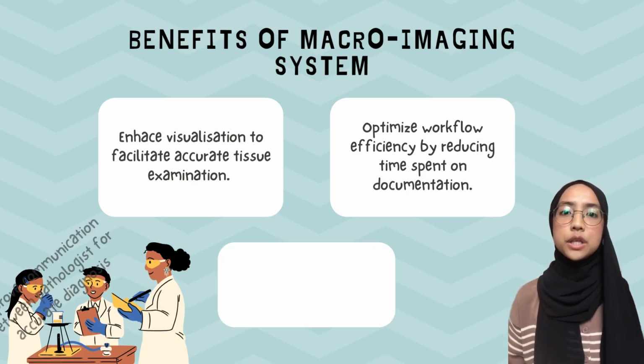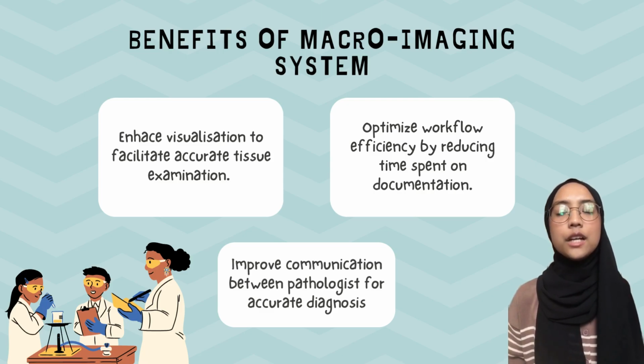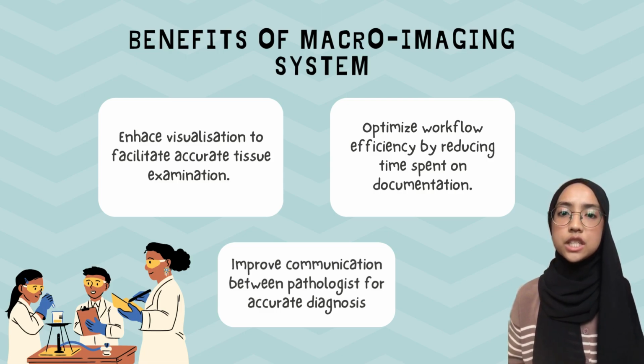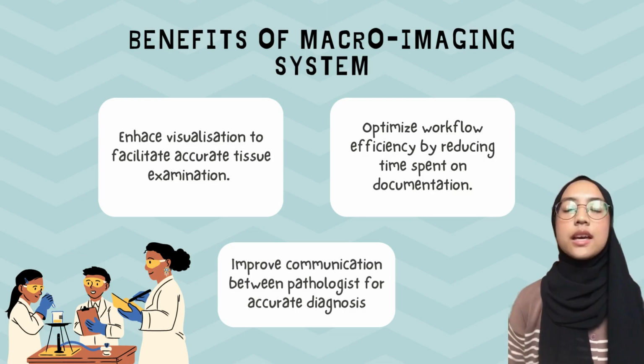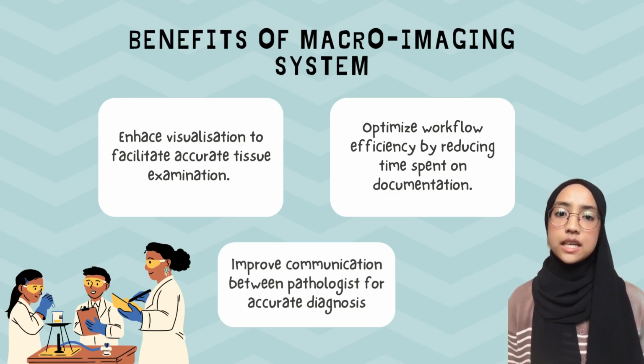Lastly, improved communication between pathologists. High-quality images enhance communication between the grossing team and pathologists by precisely illustrating specimen features such as margins, orientation, and abnormalities. As a result, unified understanding across all parties can be achieved.